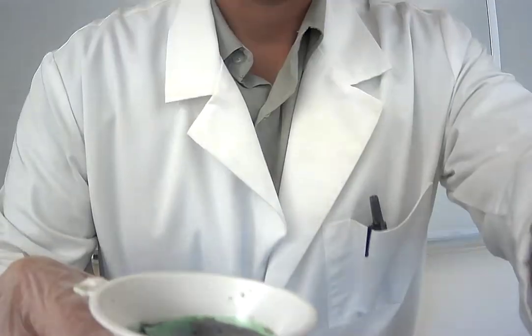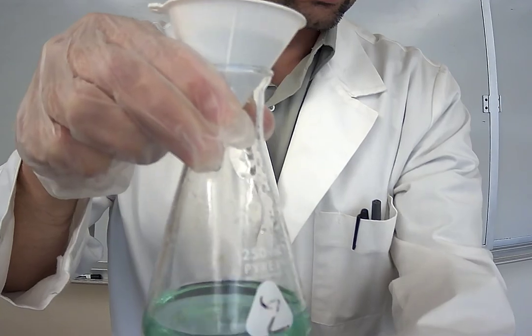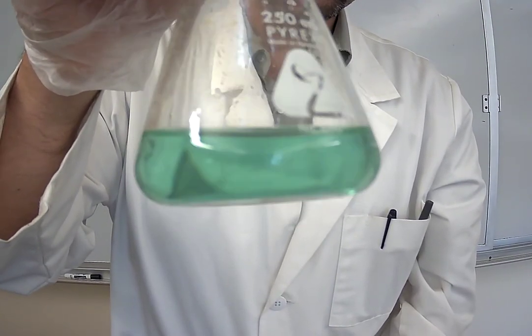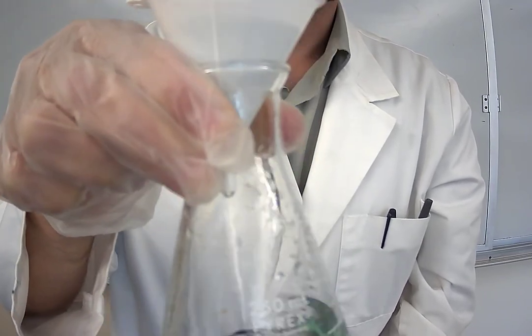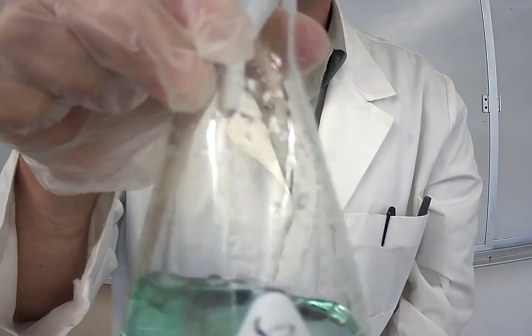And what percolates through this funnel here is the solution. You can see that that's now clear. So this is definitely not a pure substance if I can physically remove contents from it.